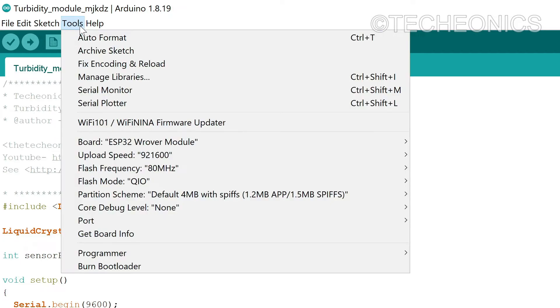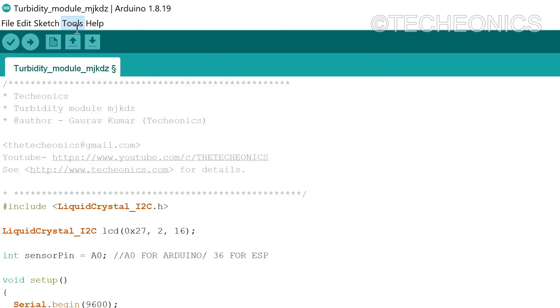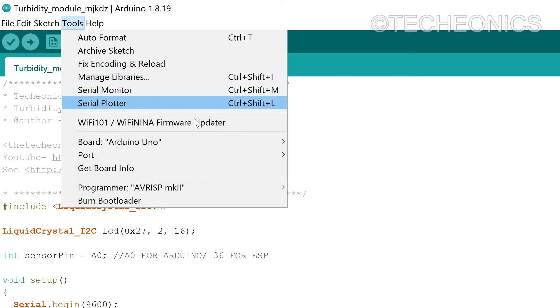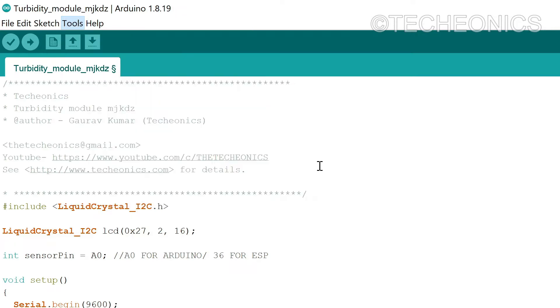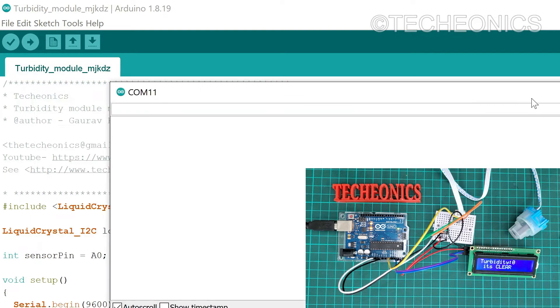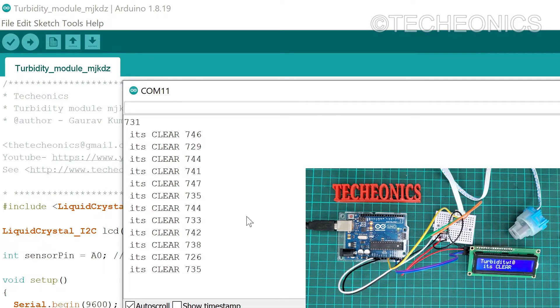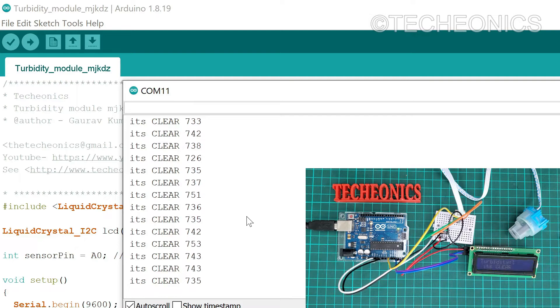Let's select the board. I am using Arduino Uno. Then select the port and upload. We are finally able to upload the code.